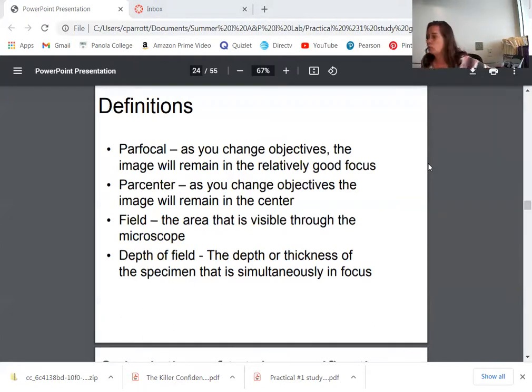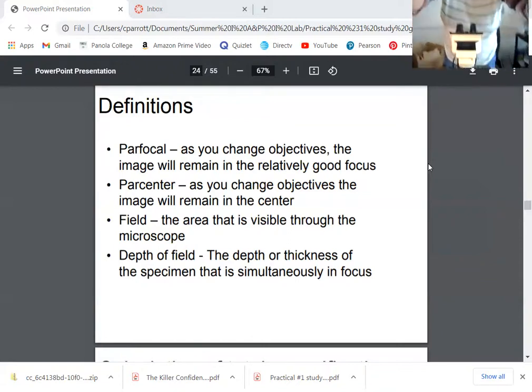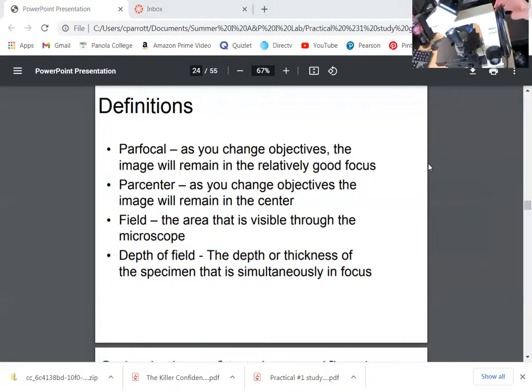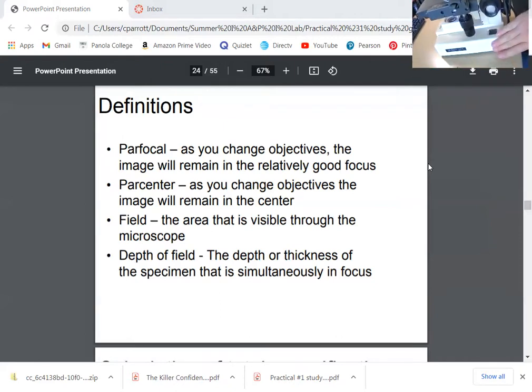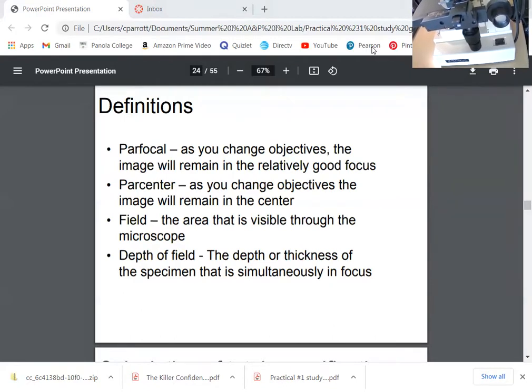Okay, so I'm going to demonstrate the microscope now. Let me rearrange my scope here on my camera. I'm just going to have to bring it down like this. So you're seeing a compound microscope right here. This is the arm, and this is the base. So you would put a hand on the base and a hand on the arm, and that's the way you would carry it.